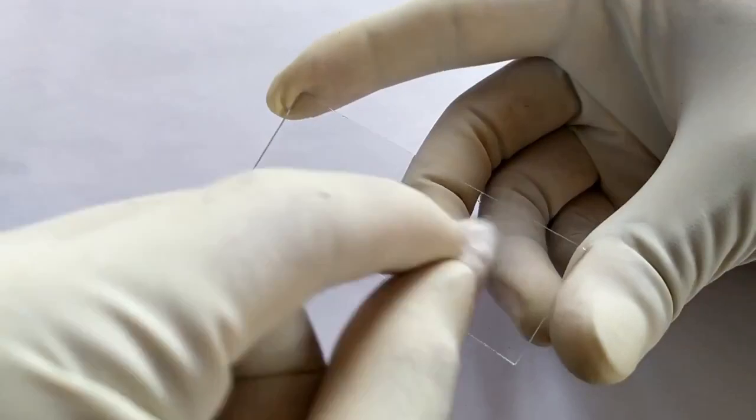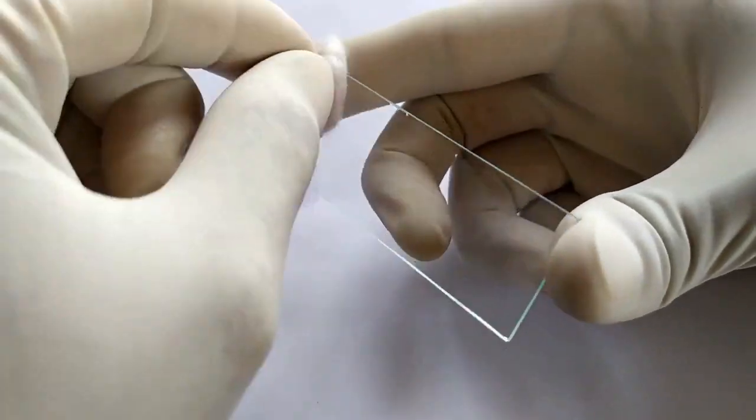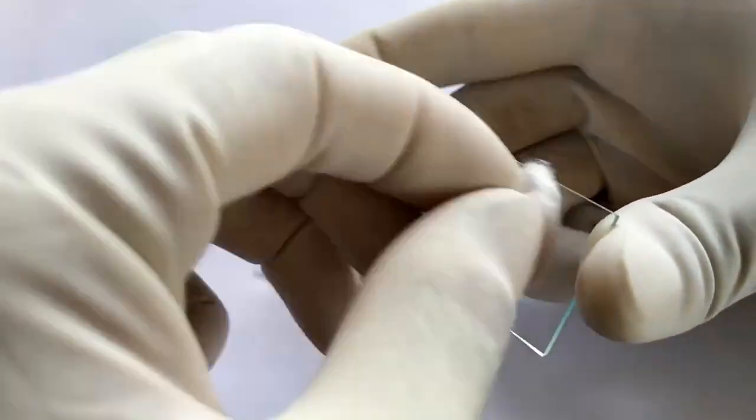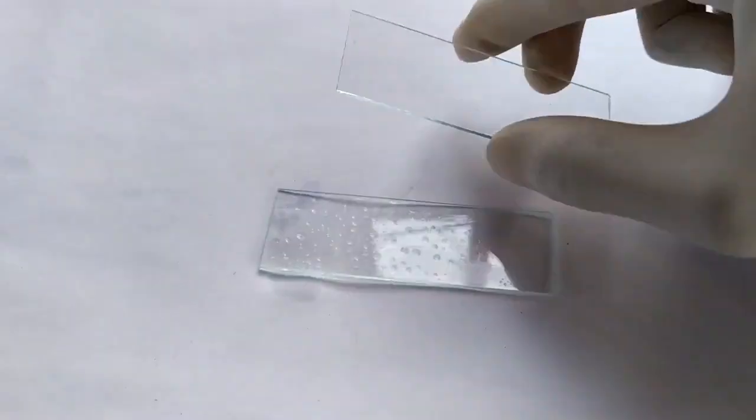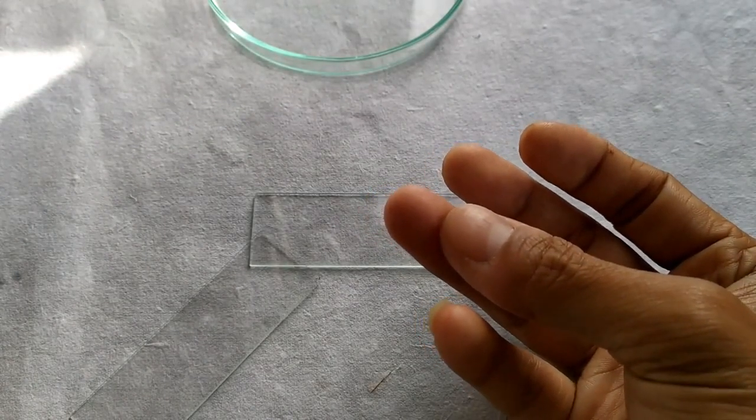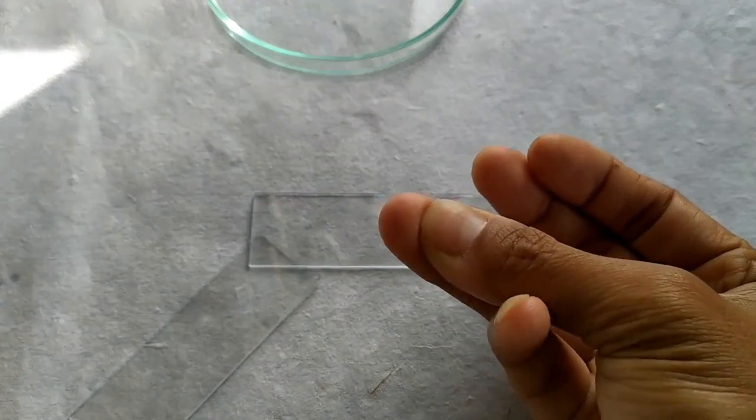Take two glass slides and clean them with 90% alcohol. Disinfect a finger with alcohol and prick with a sterile lancet or a pricking device.